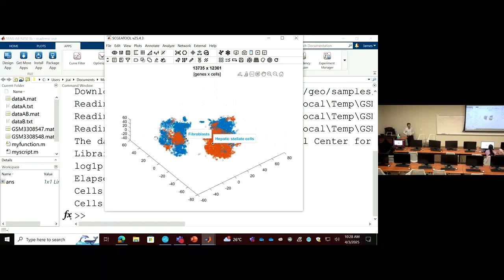Different samples I will show you in a separate view. To get this, you go to the big eyes here. Then select multi-grouping. Then OK. Yeah, you see the same picture. Similar idea.